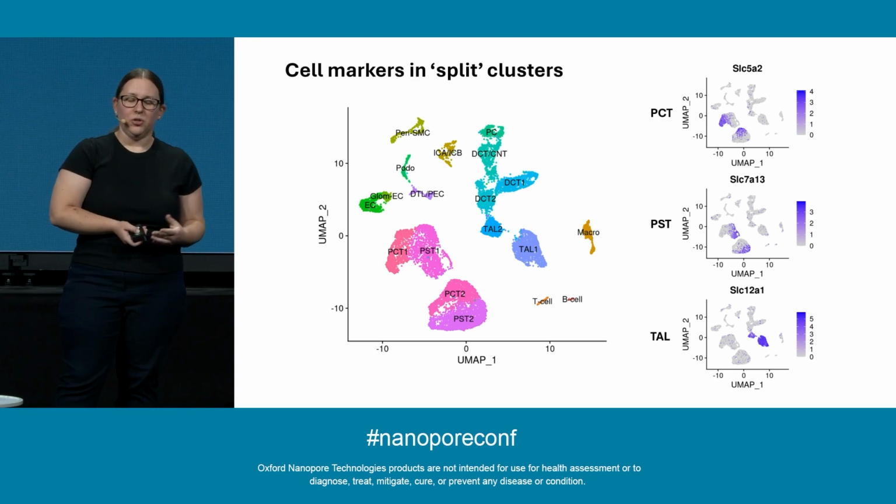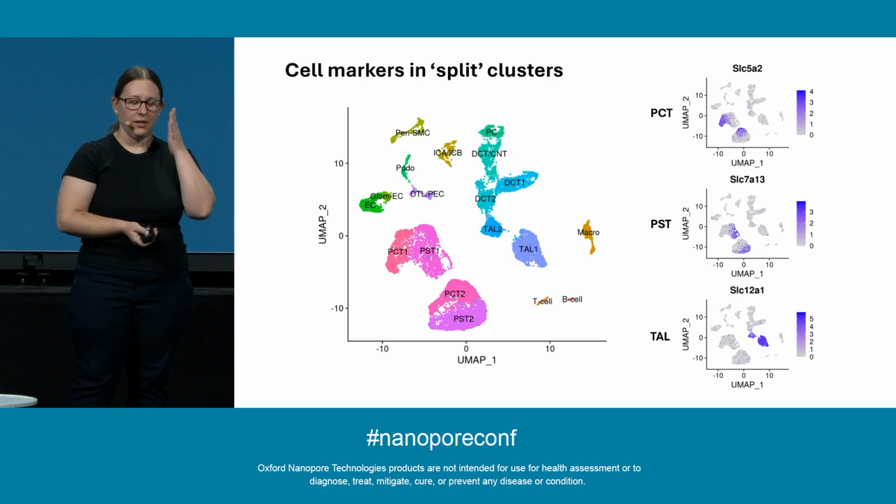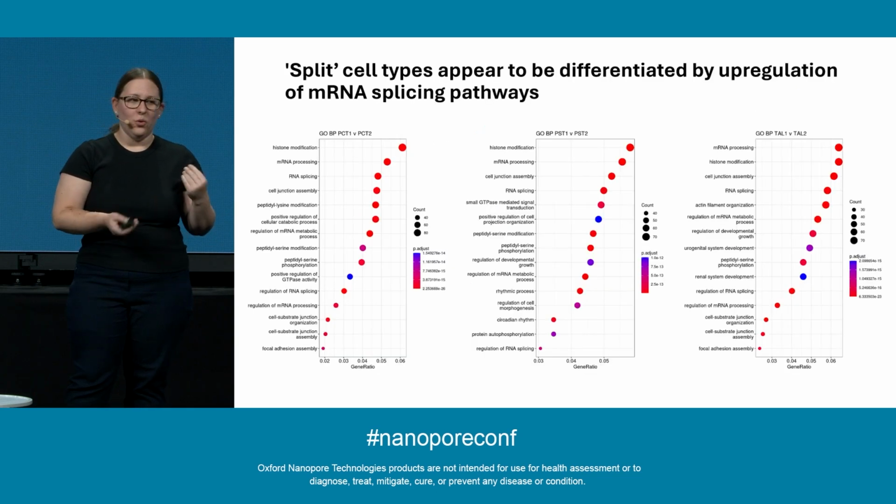So as of right now, I'm treating them as different. I'm not sure it will stay that way, but it is quite interesting that we're seeing this with just our long read data. Our lab has done a ton of short read kidney work, and we've never seen this, so it's quite interesting.